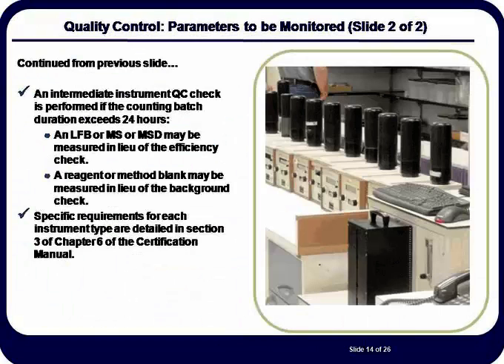The requirements for the quality checks on the instruments are shown here. Each instrument has different requirements for these checks. For example, when only one high-purity germanium detector is in use, the requirements for daily checks may supersede those for batch quality control checks when the analysis of the batch spans more than one day.